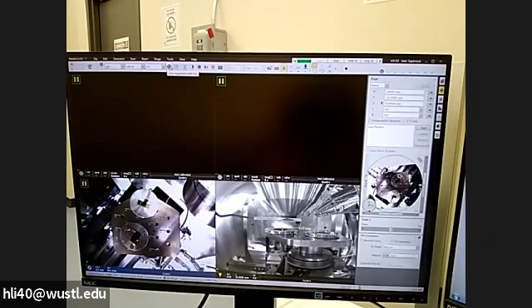So the next thing is the alignment. We have lens alignment, this is reduced area, and we have a link button here, and we also have a number of buttons with arrow keys under it. So this is automatic. If you click, it will automatically do it. I normally only suggest users do automatic contrast brightness. The other automatic operations need a good, uniform sample, for example, gold nanoparticle samples. If your sample doesn't have a uniform feature for the software to do the calculation, then this alignment won't be as good as you doing it manually.